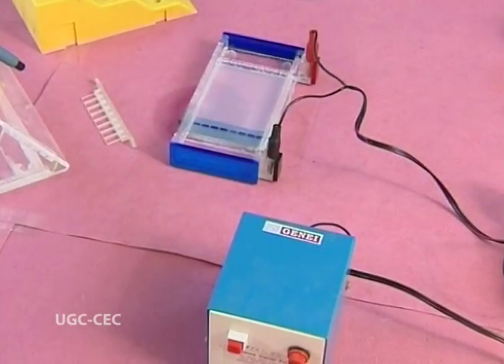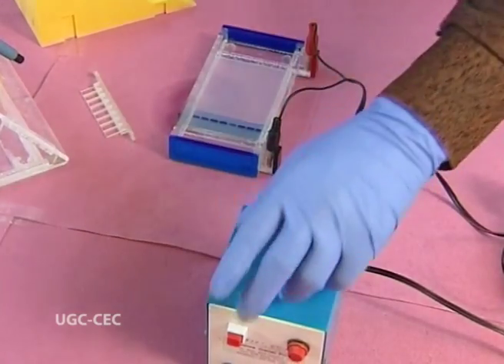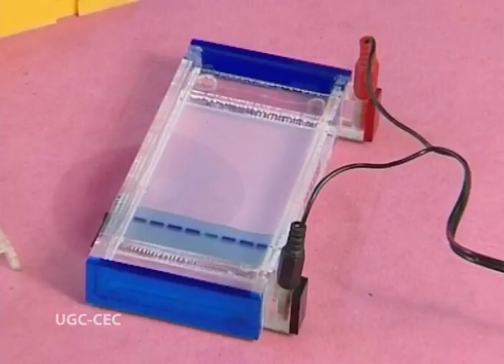Now once the wells are loaded, it's time to supply the power current. We have to make very sure that the wells are towards the cathode, that is negative charge, and the other side is the anode, that is positive charge, because DNA is negatively charged and after passing the current it will move towards the positive. Now the black one is the cathode and the other red one is the anode.